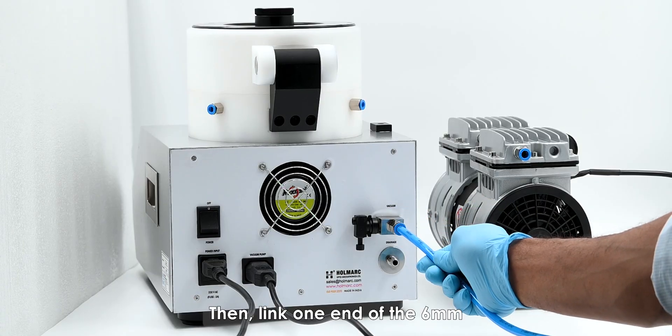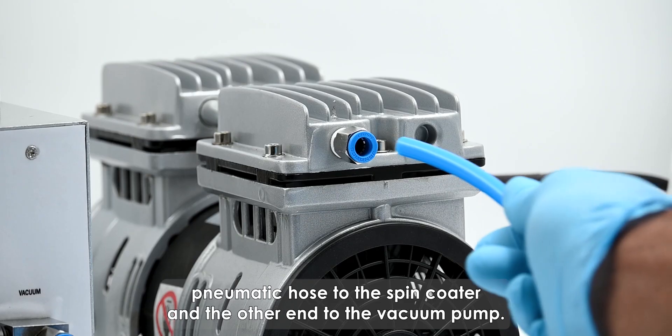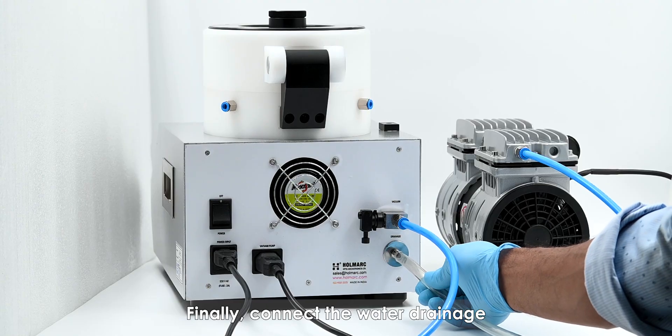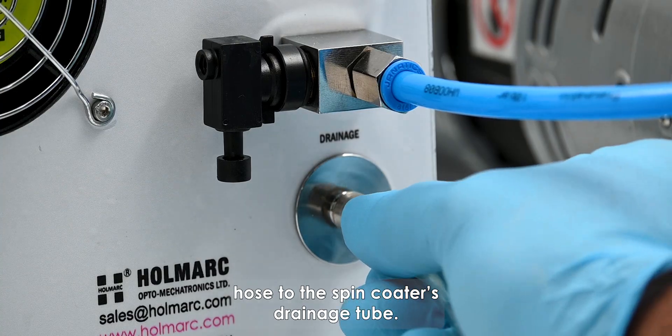Link one end of the six millimeter pneumatic hose to the spin coater and the other end to the vacuum pump. Finally, connect the water drainage hose to the spin coater's drainage tube.